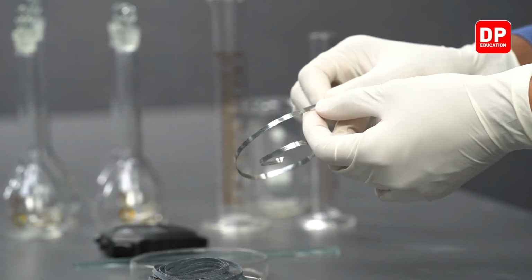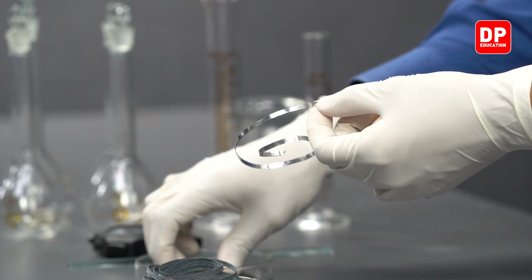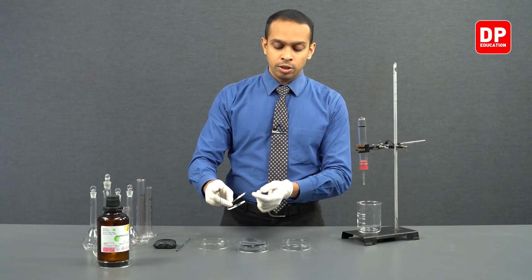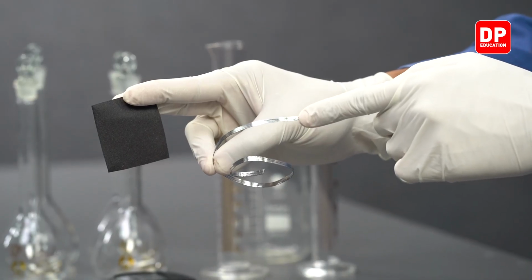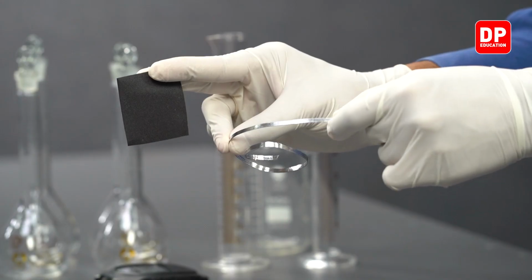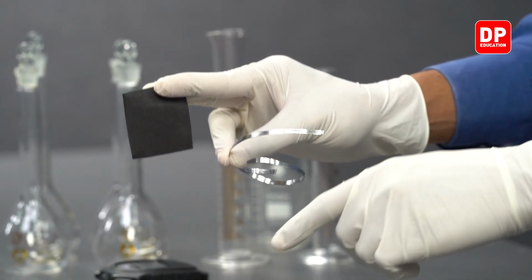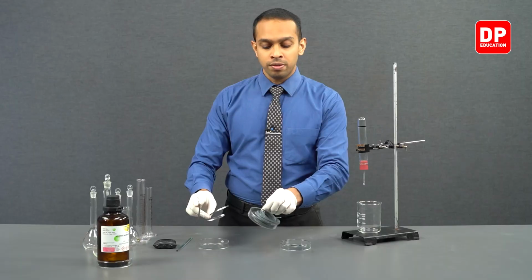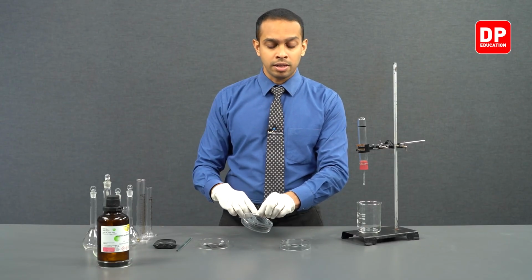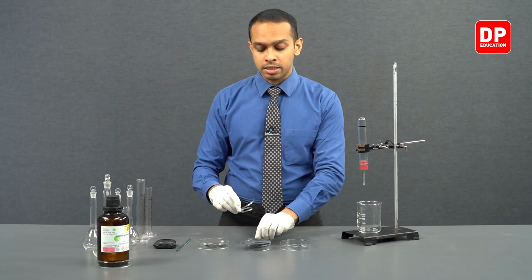So after stripping it off with sandpaper, it's going to appear like this. A shiny magnesium strip should be used for this experiment. So in your lab, you will observe your magnesium strips to be dull in color, just like this, because of the outer coating that it has.